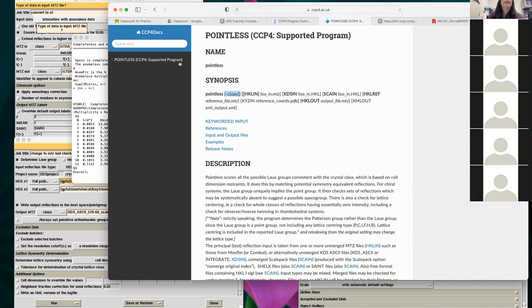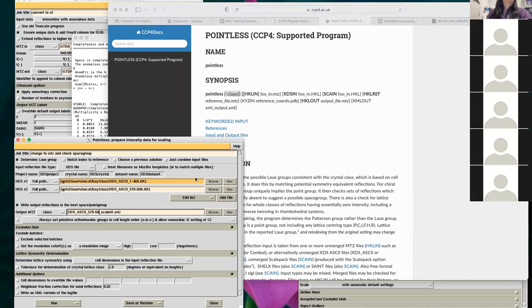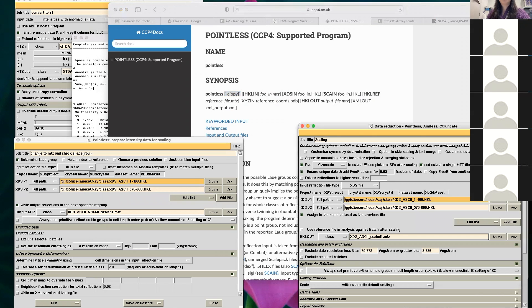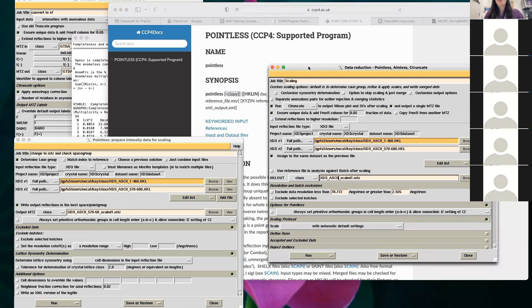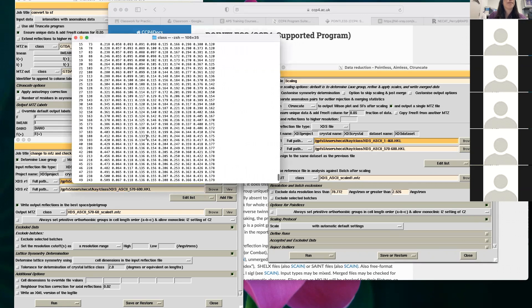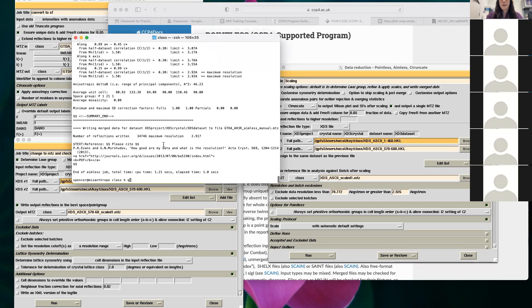Now let me come back to the CCP4I interface. In CCP4, they will take a bunch of programs and string them all together — so when you come into one task, it will do all the steps. In this example, it will do Pointless, Aimless, and Truncate. What Truncate does is convert your intensities to structure factors.